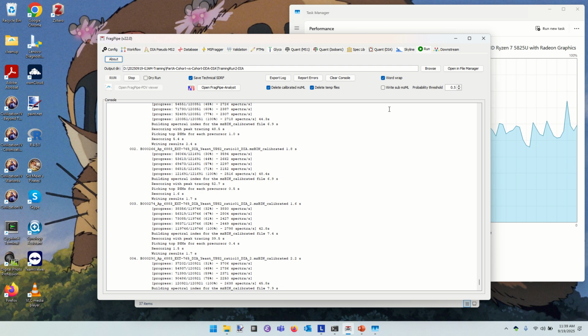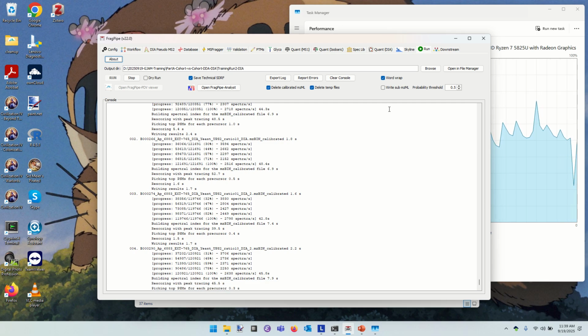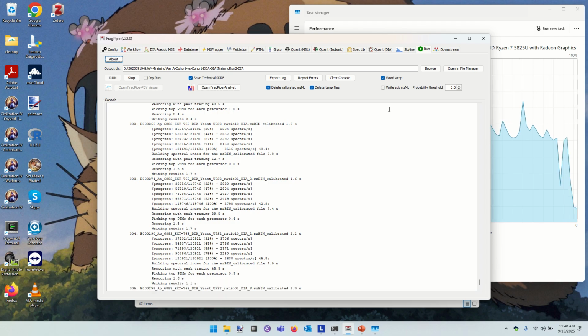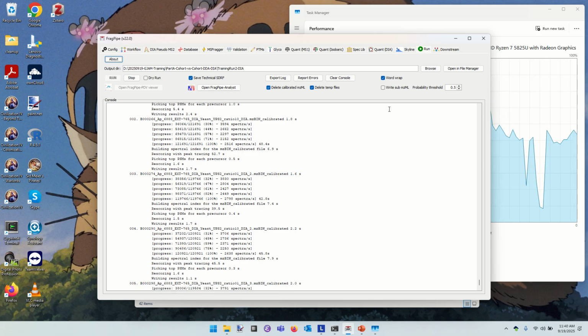But it's not all that open as source code goes. So do we know that the way that these three approaches compute false discovery rates are really comparable? Do we expect that if I identify a peptide with one of these engines, it should be identifiable by all of them? There are some important differences here.